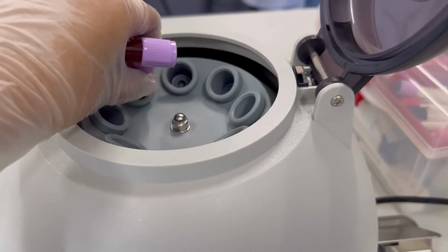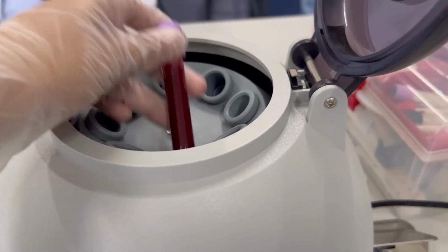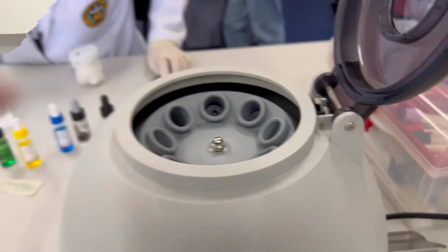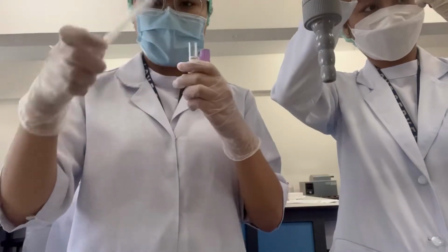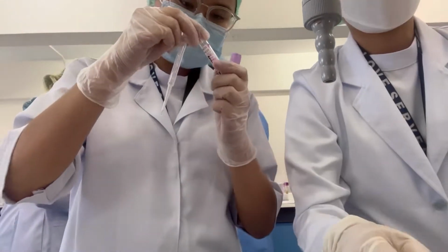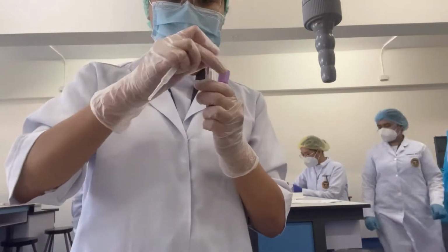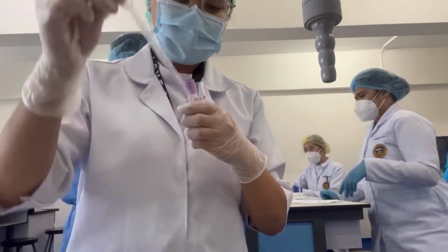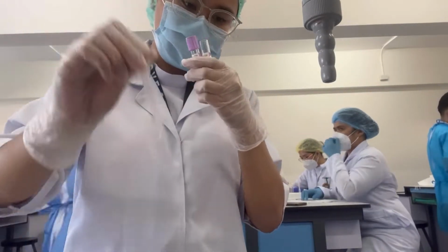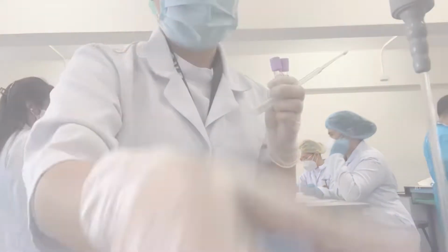Then, centrifuge the sample for 2 minutes at 3,400 RPM or at speed of 10. Using a pipette, discard the supernatant on the sink. Then, repeat steps 2 to 5 up to 3 times.